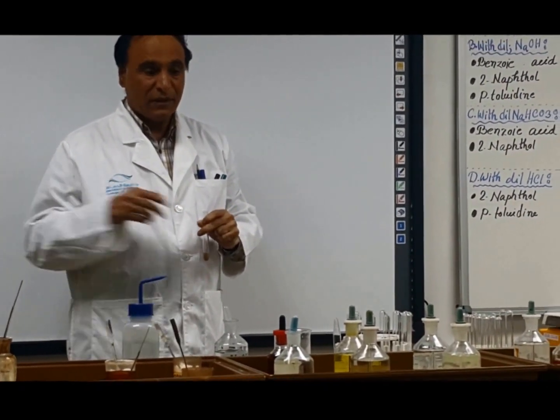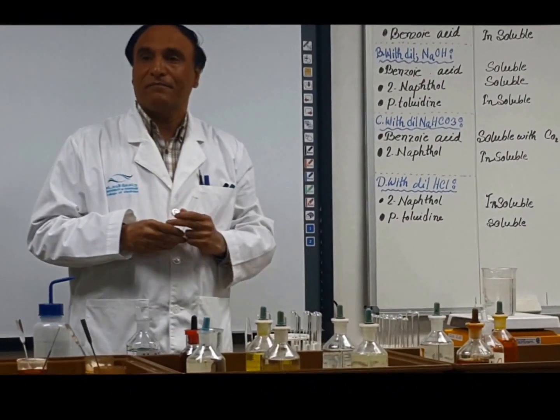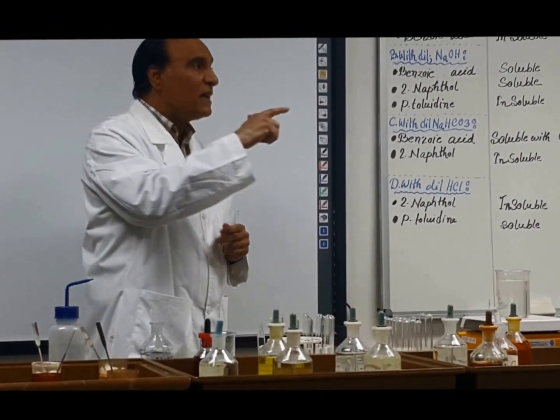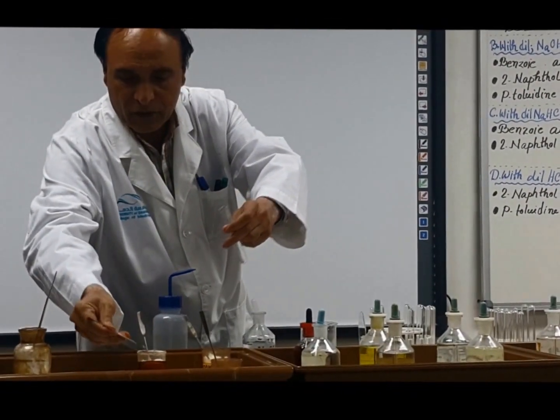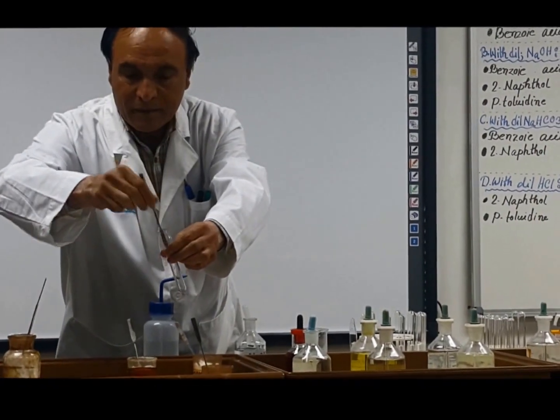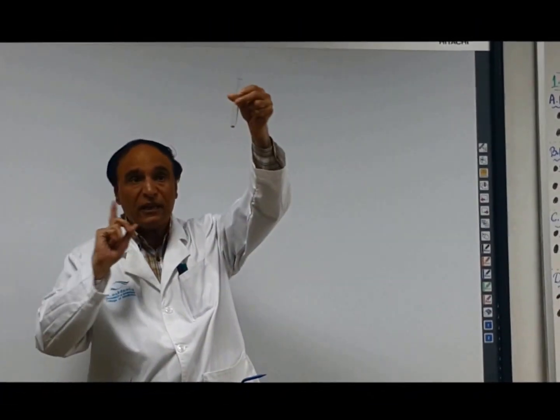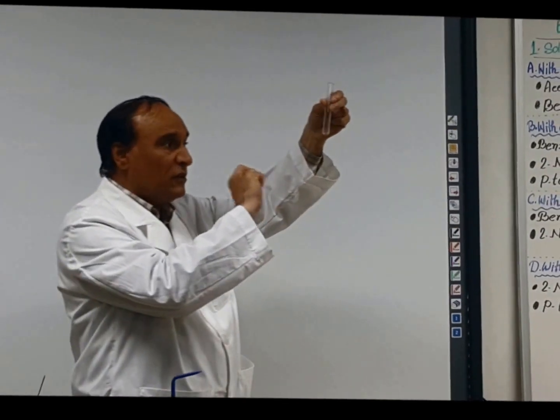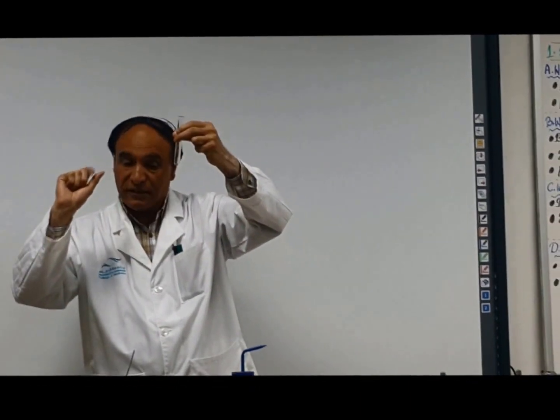Did you understand? If I have something basic, a base will not dissolve in a base, right? So let's suppose I have paratoluidine. Paratoluidine, look, I'm taking a very small quantity. Take care regarding the quantity.